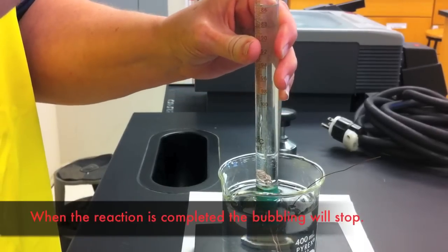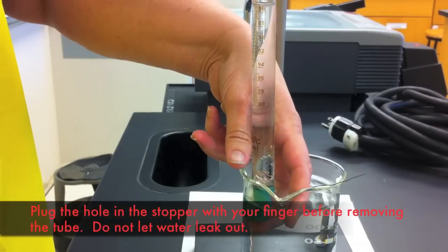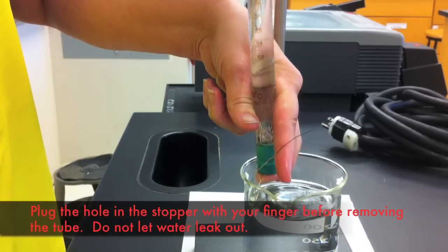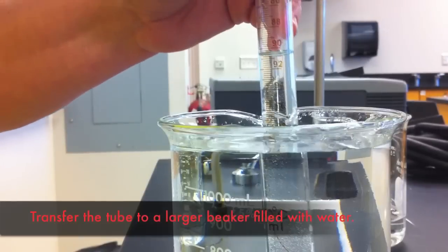You will know that your reaction is complete when you stop seeing any bubbles being formed from the magnesium ribbon. At this time, you need to remove the burette from this beaker and transfer it to a larger one. Place your finger over the hole in the stopper to ensure you do not lose any liquid during the transfer.